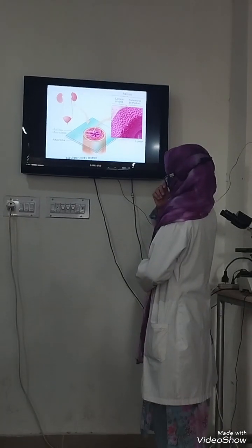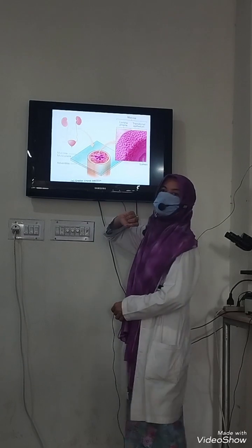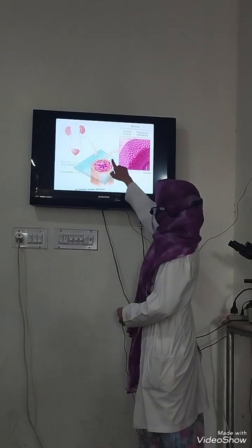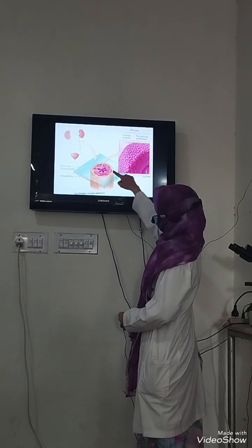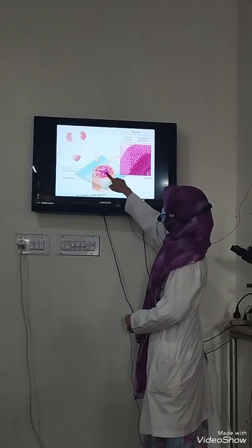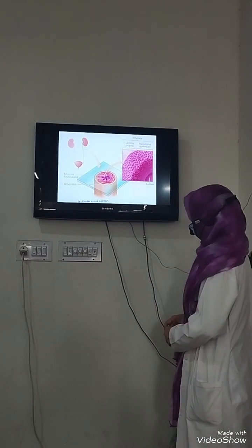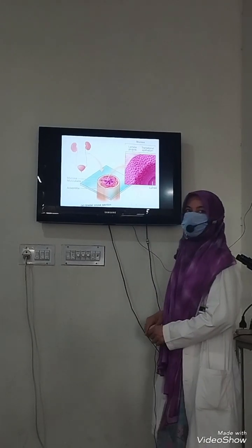Now, we have to study the histological feature. For that, we take the transverse slice of it, right? In this, what we see again, the layers. We start from within inwards to outwards. So the innermost, that is shown in this eosinophilic darker stain, is its mucosa, right?